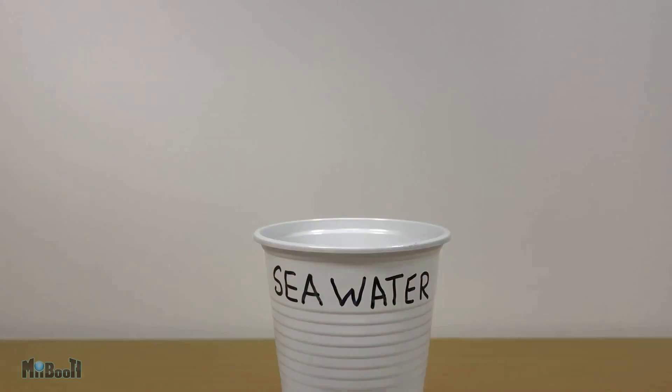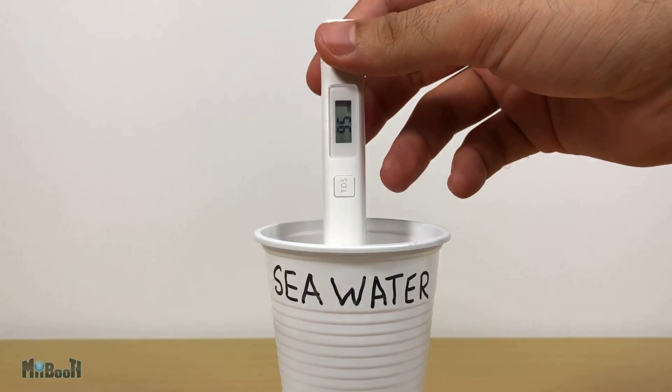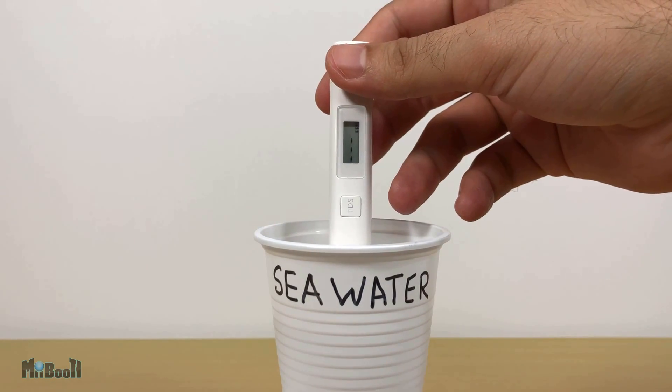Finally, I have something which I think will break the machine — seawater. For my last video on the waterproof case, I paid a visit to the beach and thought it would be a good idea to fill up a bottle and bring it back. As I predicted, the device goes blank.